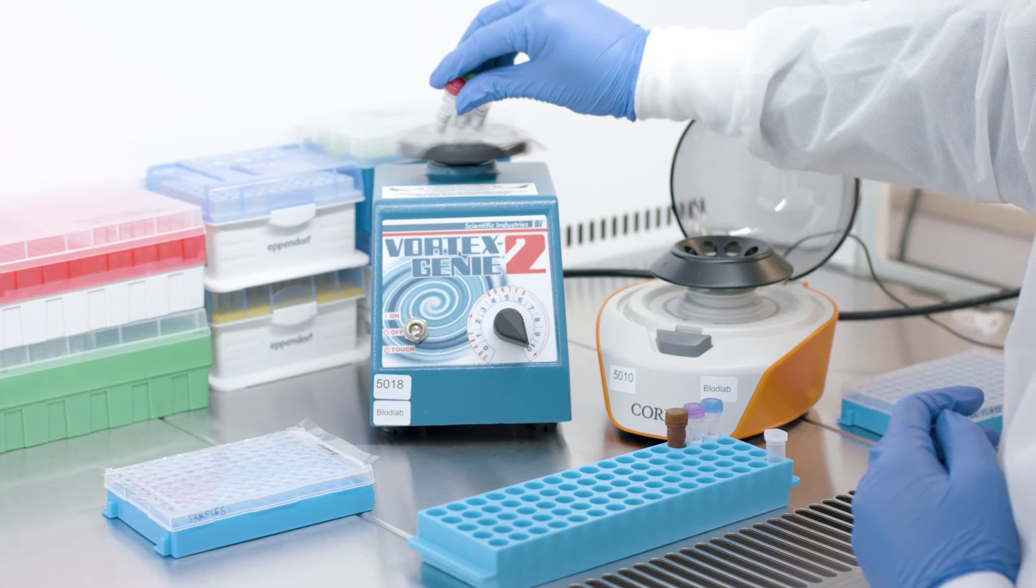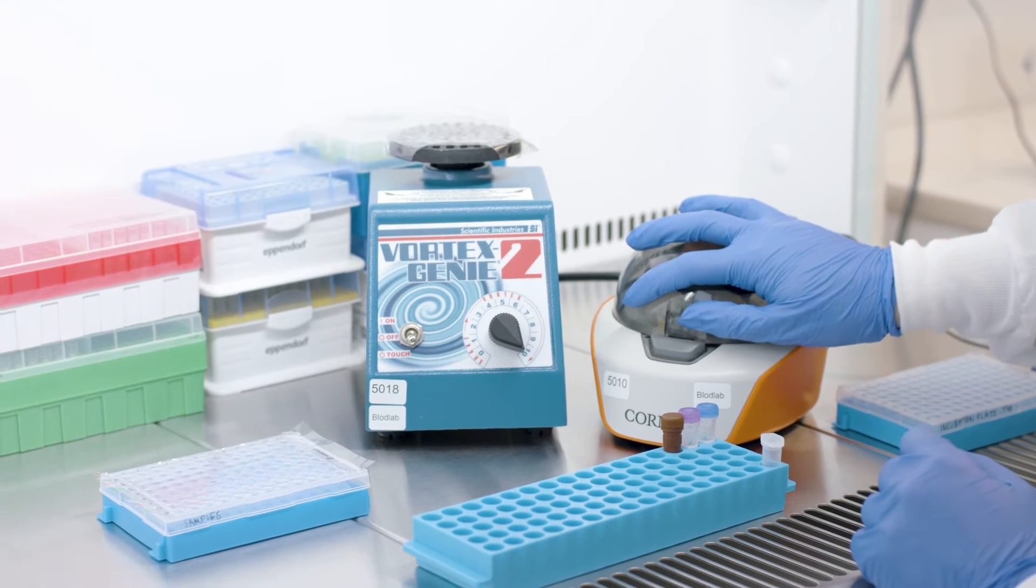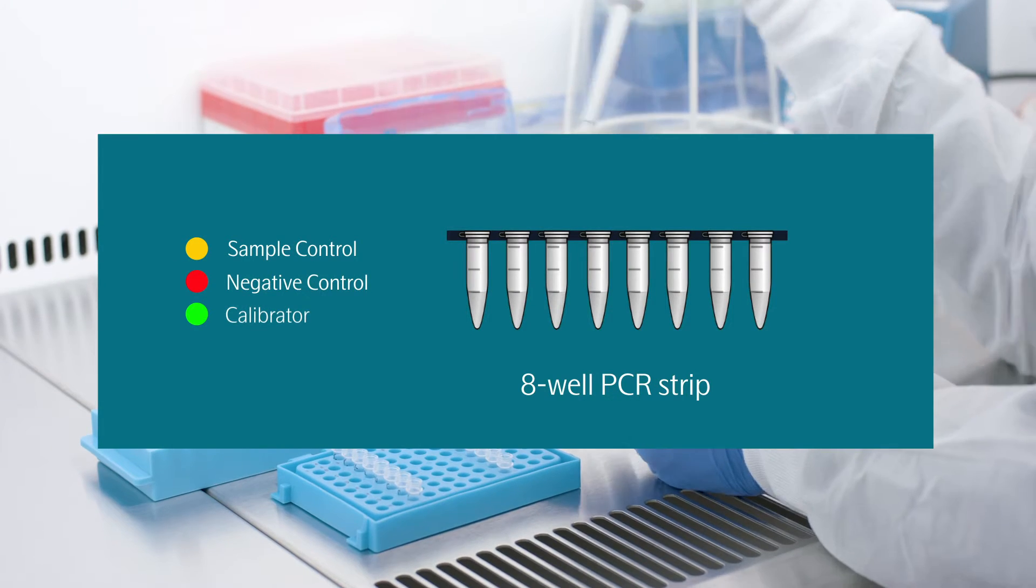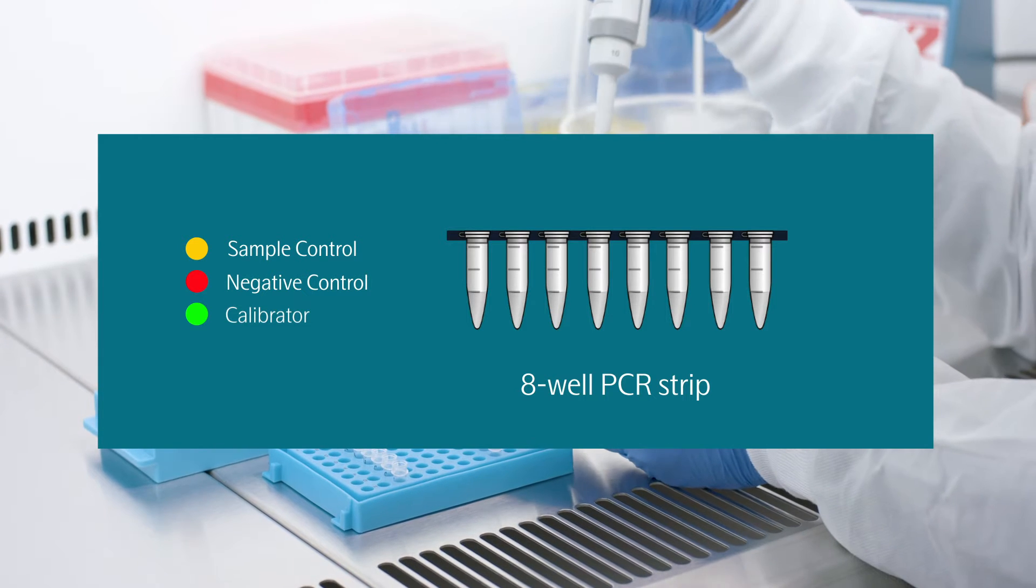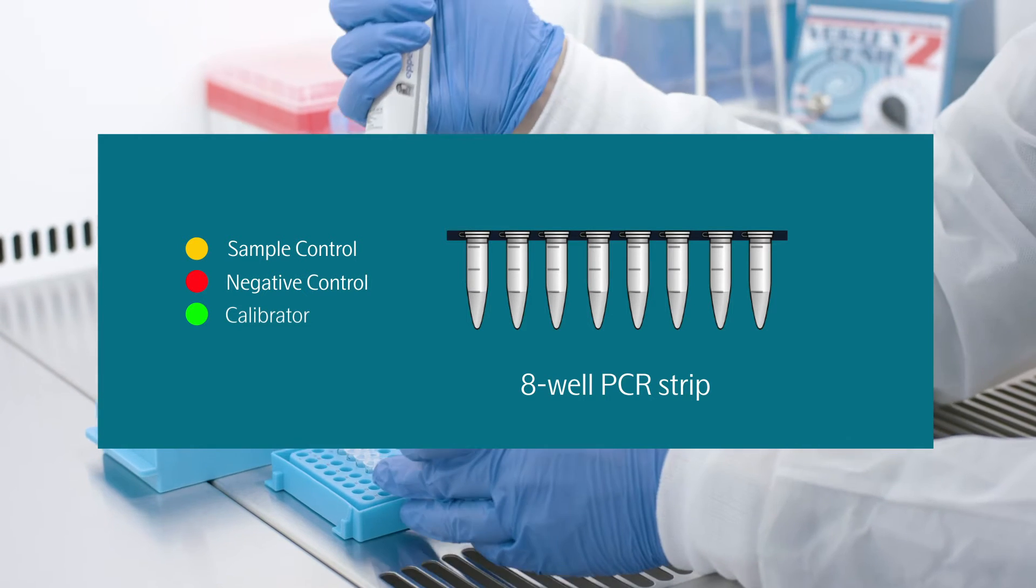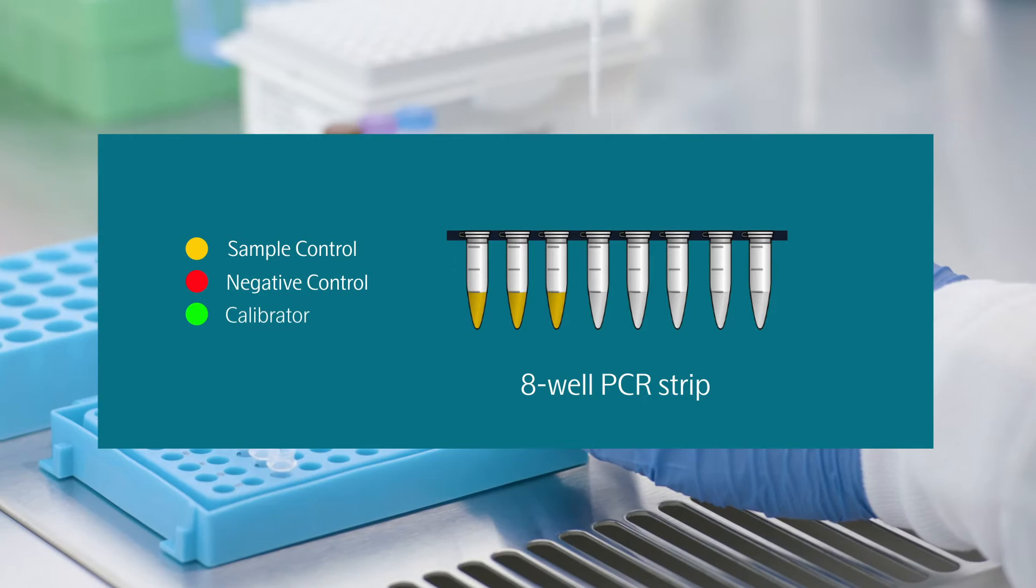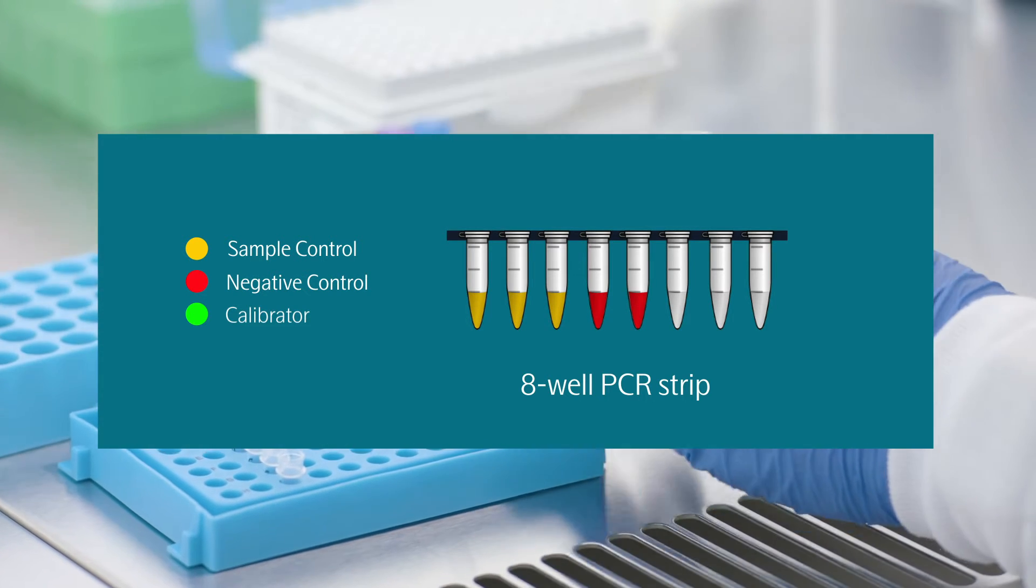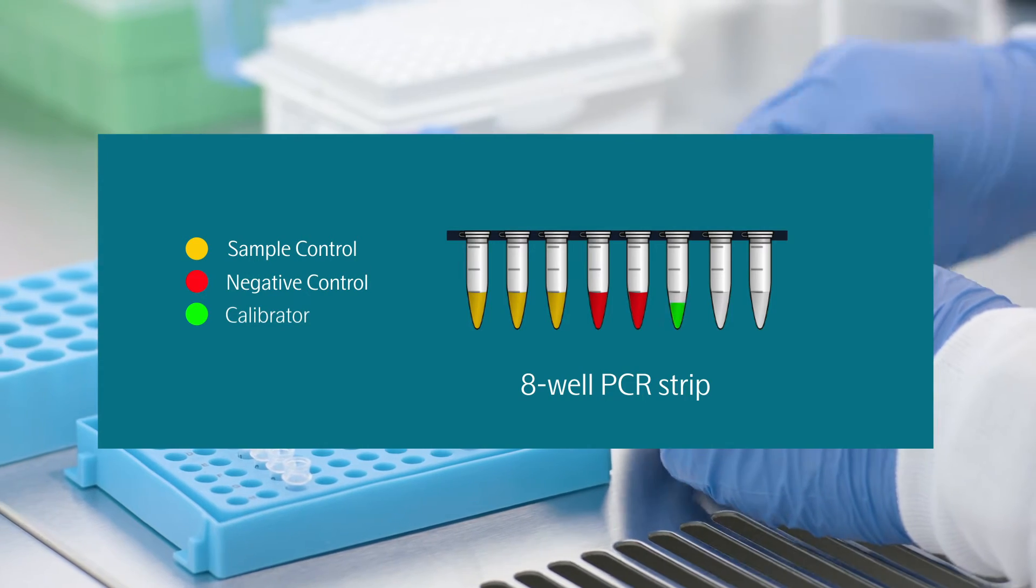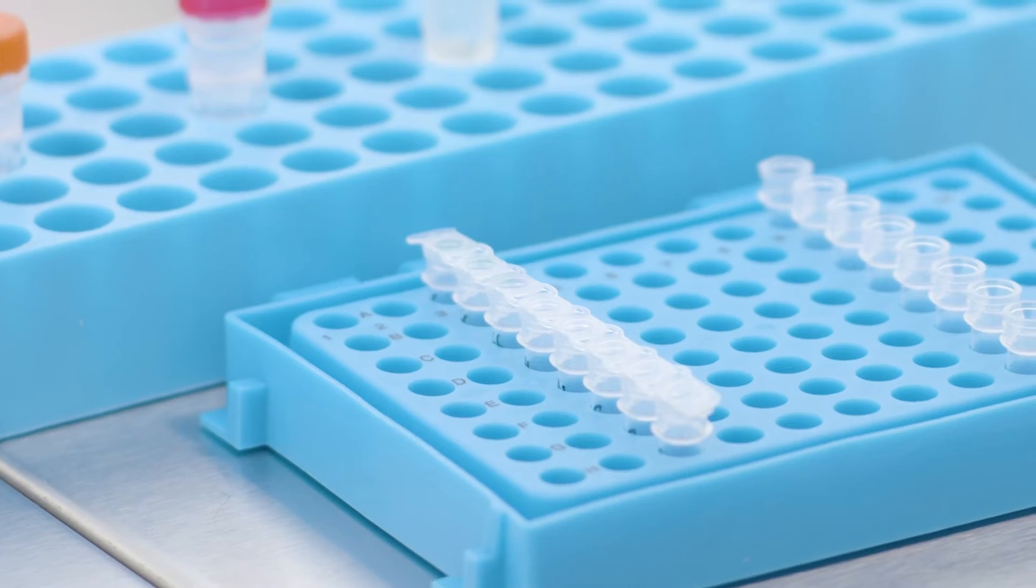Vortex the negative control, the sample control, and the calibrator, and spin them down briefly. Label an eight-well PCR strip with these controls according to the following order. Pipette four microliters of the sample control into the first three wells, four microliters of the negative control into each of the next two wells, and four microliters of the calibrator into the final three wells of the PCR strip. Cover the strip tubes and set that aside.